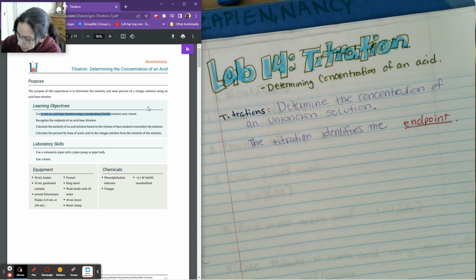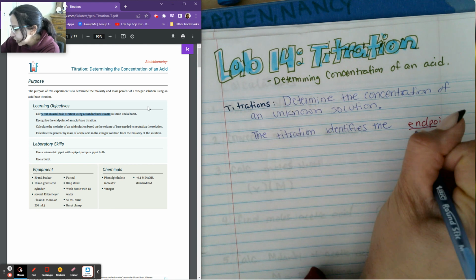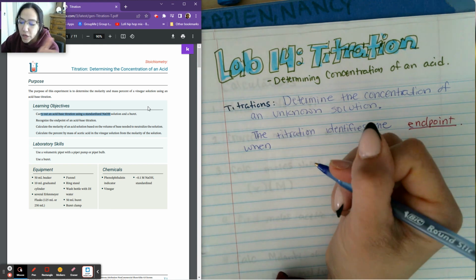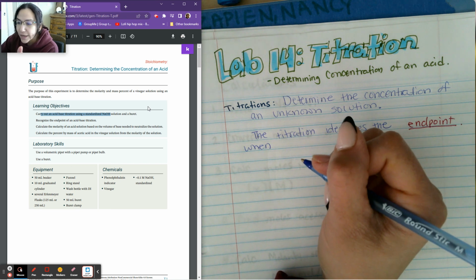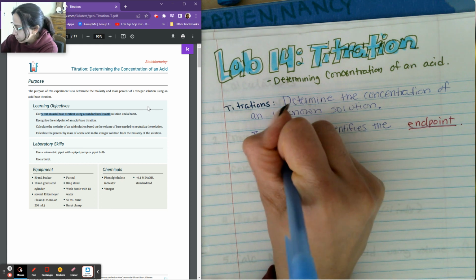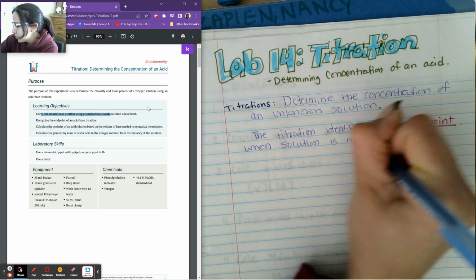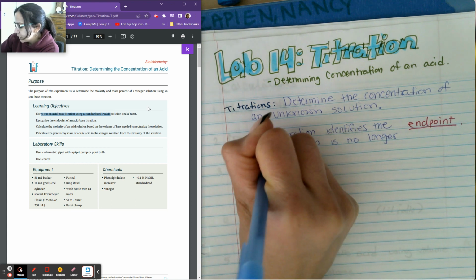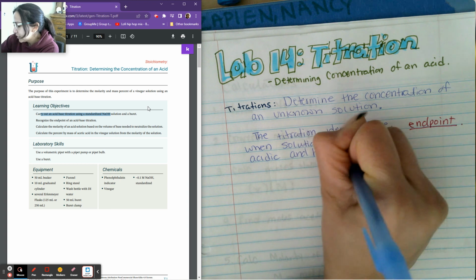Basically, the endpoint is when your solution is no longer acidic and has just turned basic.